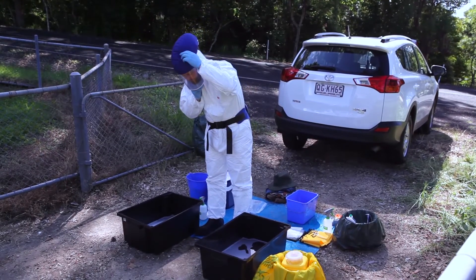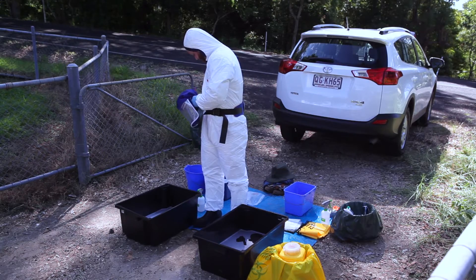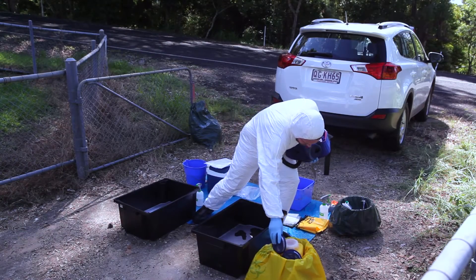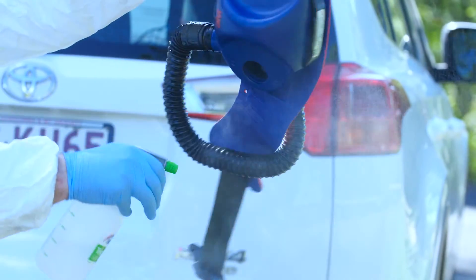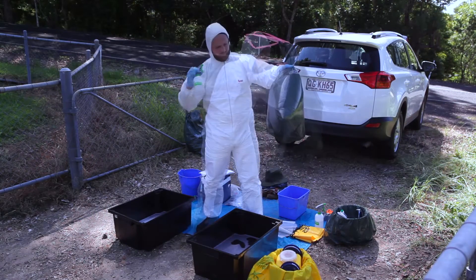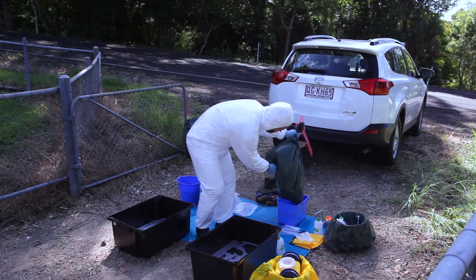If you're wearing a PAPR, this device should now be removed. Remove the respirator, then unclip the body of the device from your waist. Unscrew the air filters and dispose of them in a biohazard bag on the dirty side. Disinfect the entire device — you can use a sponge to wipe disinfectant over the battery pack. Place the PAPR in a new garbage bag, seal and spray with disinfectant, then double bag, seal and disinfect again, and place on the clean side.